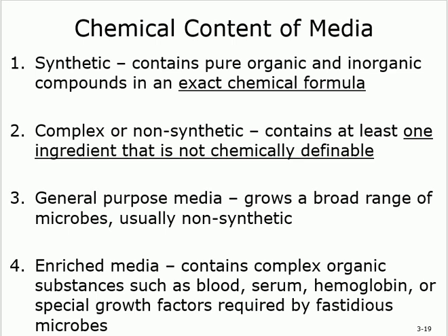Okay? The second one, which is not synthetic, so you don't have much say on it, we call it the complex. And this is the one that contains at least one ingredient that you don't know what it is. It's not chemically definable. Is that clear? If you know every single detail, you made it. And you know all the details, exact numbers.